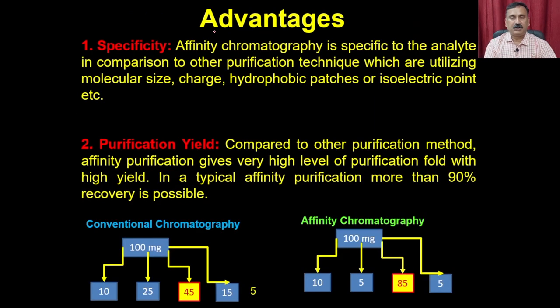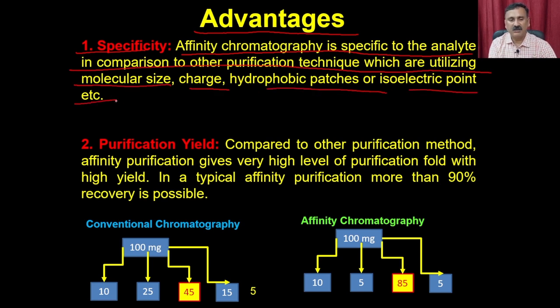What are the advantages of affinity chromatography? First is specificity. Affinity chromatography is specific to the analyte in comparison to the other purification techniques, which utilize molecular size, charge, hydrophobic patches, or the isoelectric point.